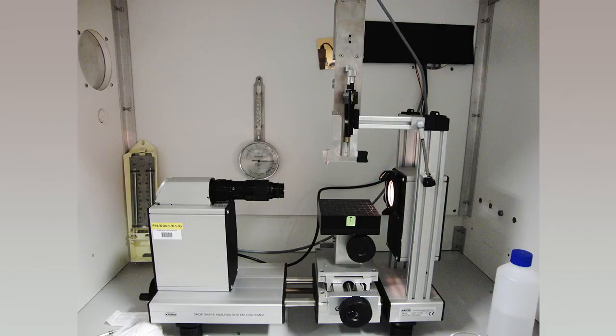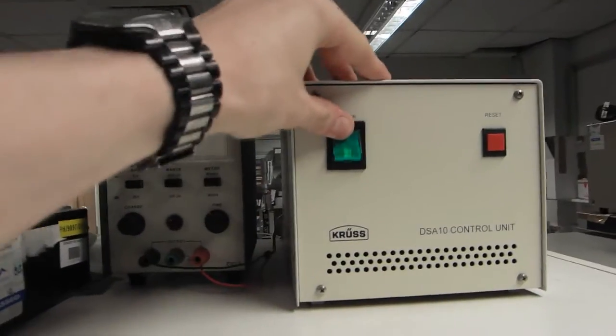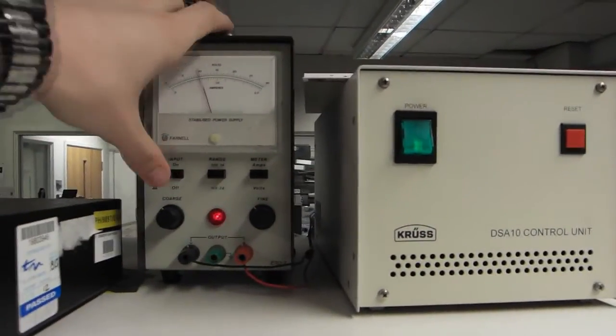Also in the enclosure are instruments for measuring the humidity and temperature as these may have an effect on results. The first step in making a measurement is to turn on the power to the control unit and the backlight.